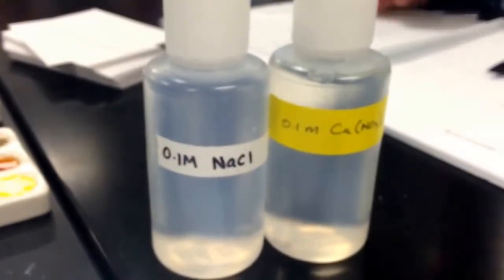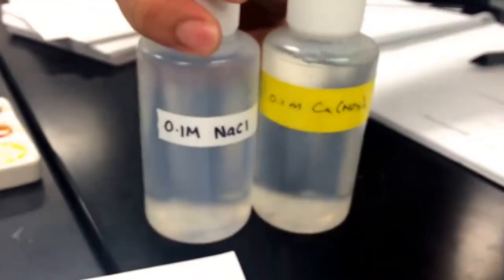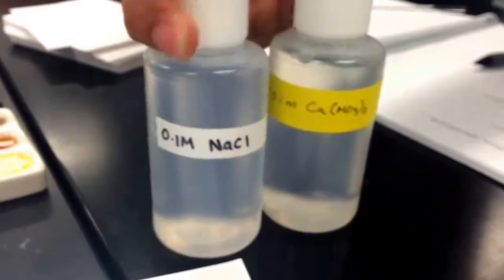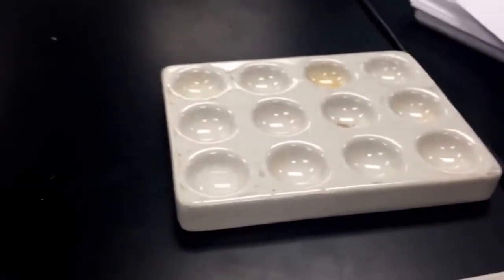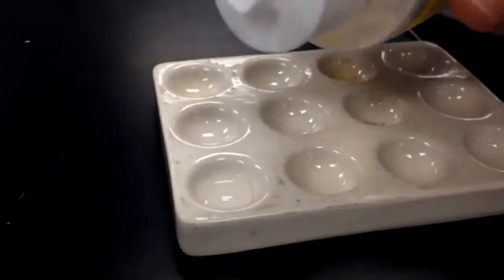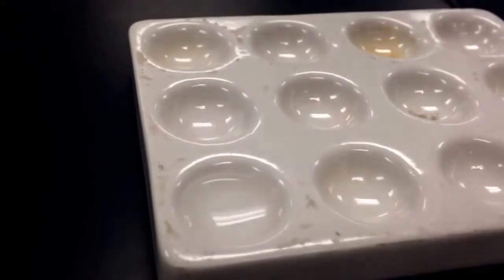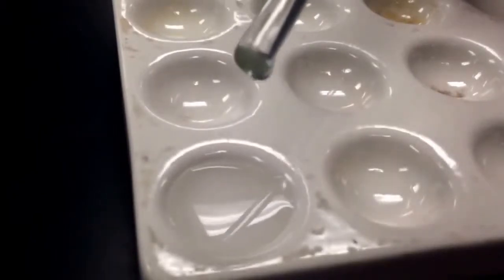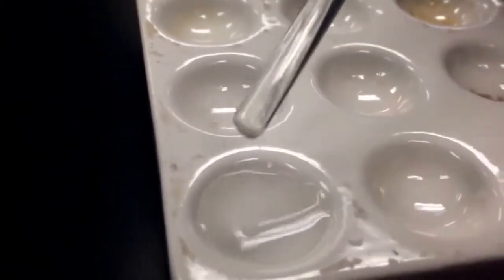And for our last experiment, we will do sodium chloride and calcium nitrate. Now these are both aqueous solutions. They've all been aqueous solutions, as I mentioned before. So it's a little bit diluted, so it's safer. Here's the sodium chloride. And the calcium nitrate here. And here's our stir, and we're mixing. And we do not see any precipitate. Therefore, when we do the calculations, we should not find any precipitate in our calculations. If we do, then we did the experiment wrong. There you go.